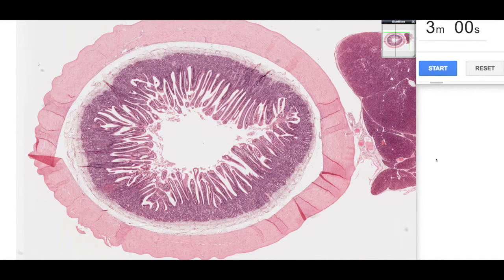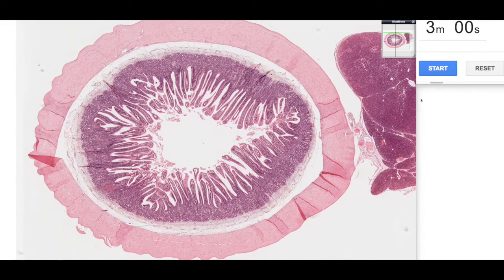G'day and welcome to another three minute histology with Jamie Chapman. Today we're going to be looking at the small intestine, so let's start the timer.